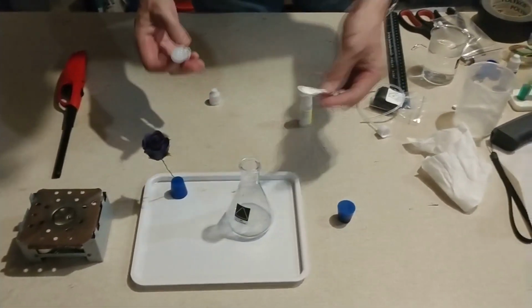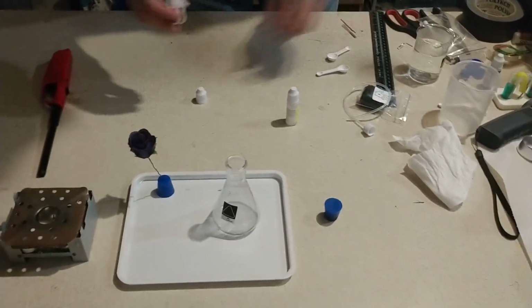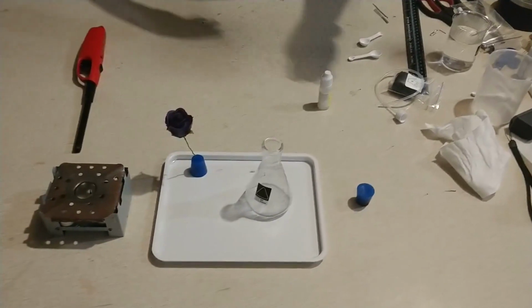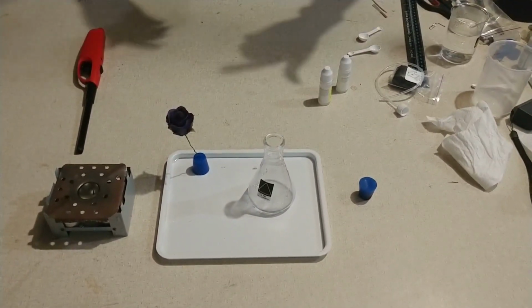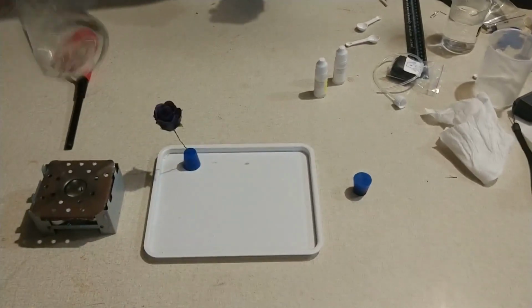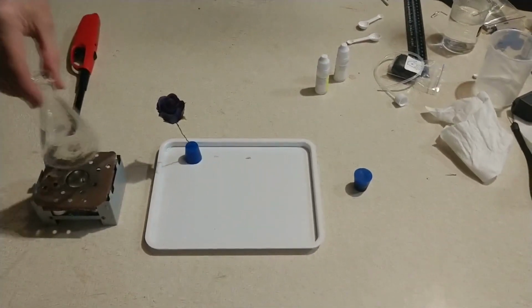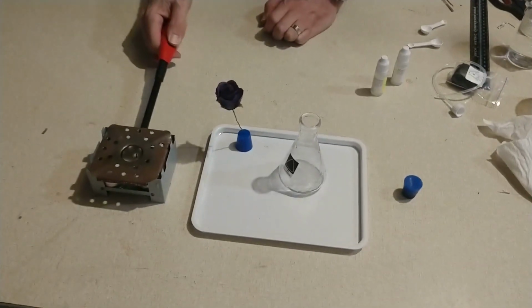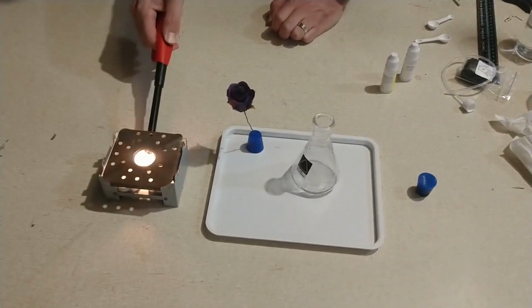Okay. Now, when exposed to acids, sodium bisulfite has a tendency to start giving off sulfur dioxide gas. However, it's not something that happens very fast unless you happen to be heating it up.